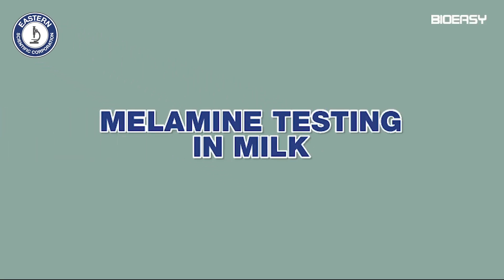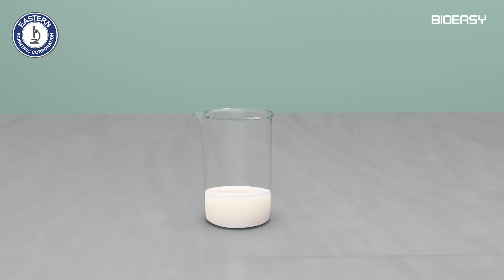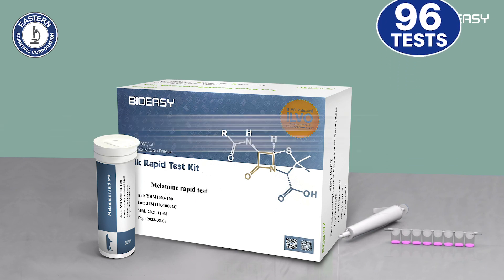Melamine testing in milk. This rapid test is used for detection of melamine in milk. It takes about 6 minutes. The milk may be raw, pasteurized, or full cream milk powder. 96 tests can be conducted using this kit.